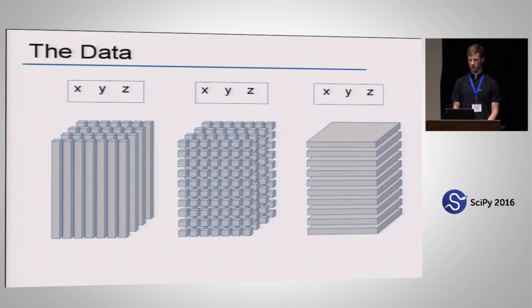And when you think about it, in all these 3 cases, it's the same data, those 3 same dimensions. The only thing we do in our minds is that on the left side, we separate the x and y dimension as being something you just select your data over, and then the z dimension is the one that's important. Conversely, on the right side, you do the opposite.